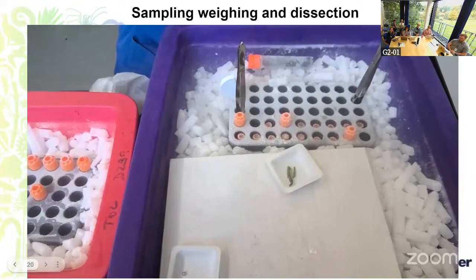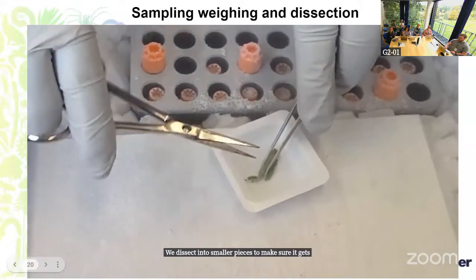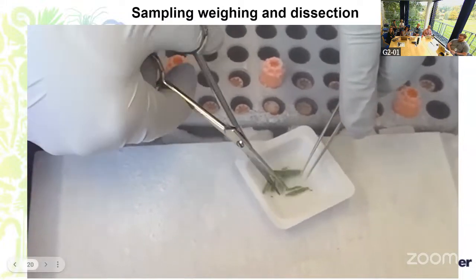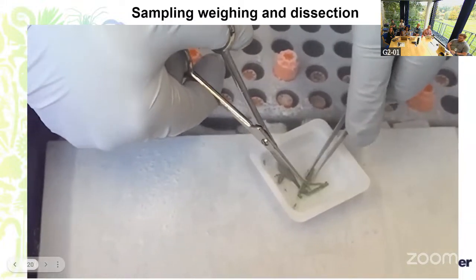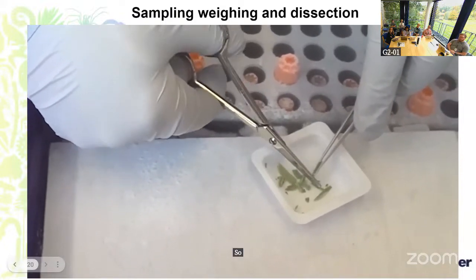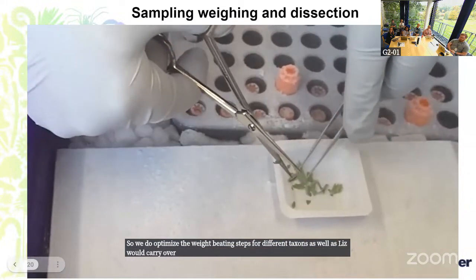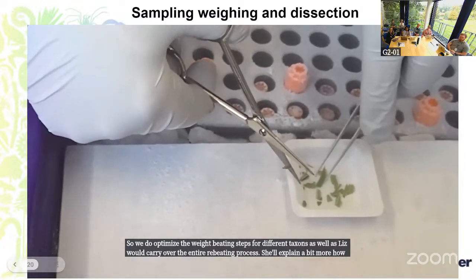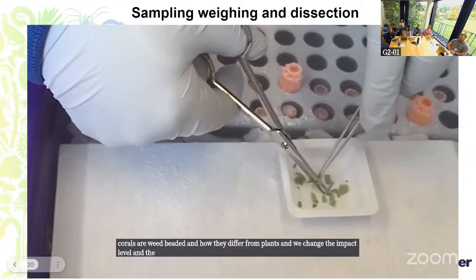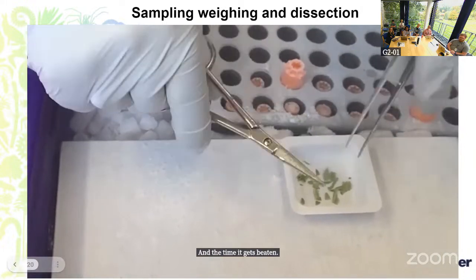Now the sample is being weighed. We dissect into smaller pieces to make sure it gets disrupted properly during the bead beating process. We do optimize the bead beating steps for different taxons, and Liz will carry over with the entire bead beating process. She'll explain a bit more about how corals are bead beaten and how they differ from plants, and we change the impact level, the time it gets bead beaten, and the different types of beads that we use for different taxon groups.